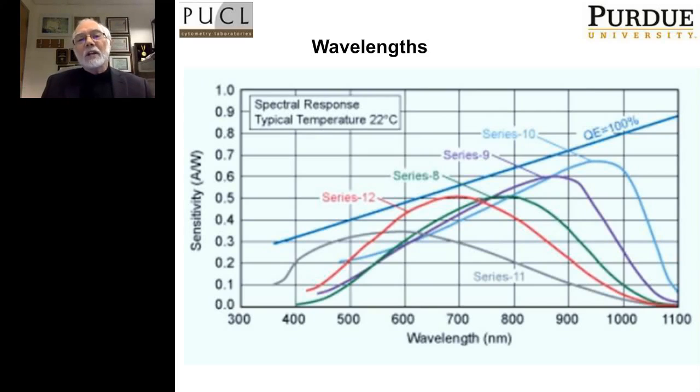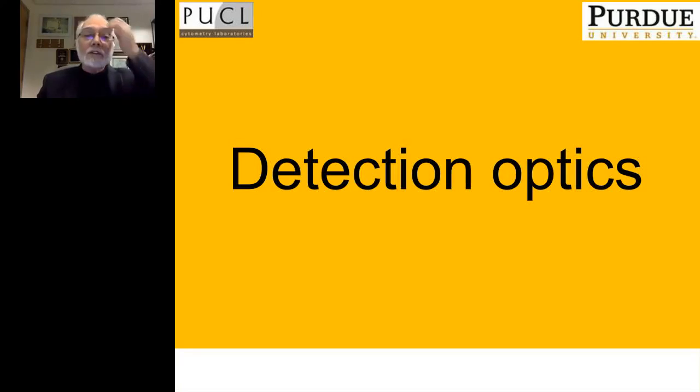And a new generation of APDs has been developed, and these APDs are very, very high quality. If you can reduce the noise of the APDs, if you can increase the efficiency of the connection of the signal to the APD itself, and if you have very clean electronics, it is possible to use an APD. And so a little later on, I'm going to talk a little bit more about APDs and how they're embedded into the CytoFLEX system and why they work so well.